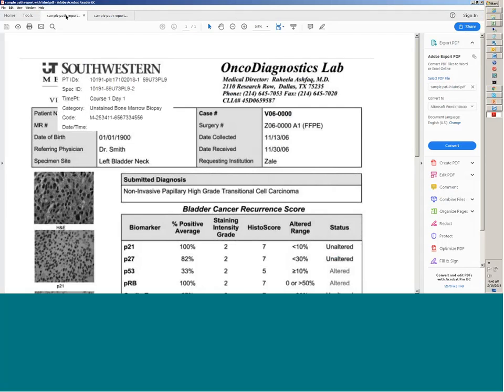And so in this instance of the report, that label, not exactly the one that we just printed, but one I had worked with earlier, is applied over that personal information. I just stuck the label right on the report and then scanned it. So this way we get the specimen ID, we have the patient IDs, and we're covering over the patient name and the medical records number.